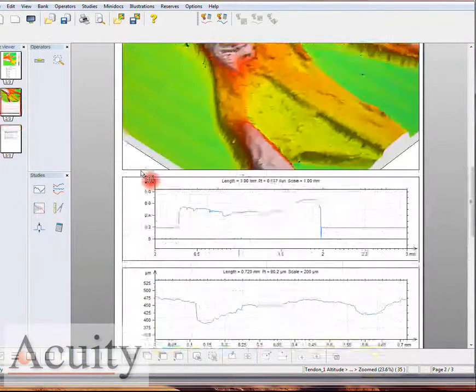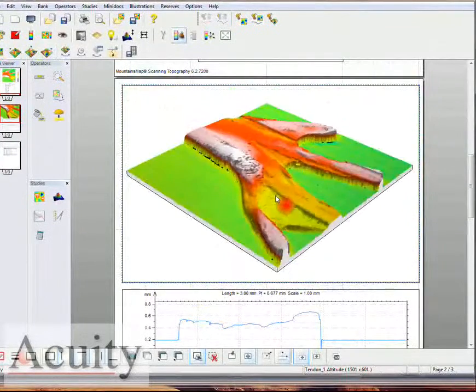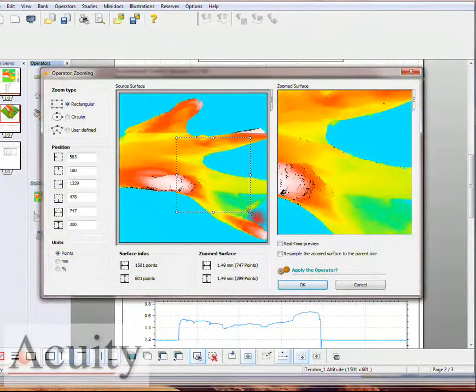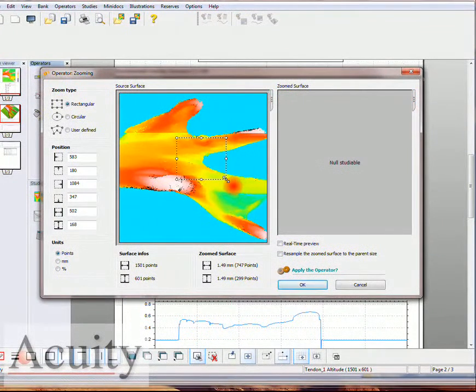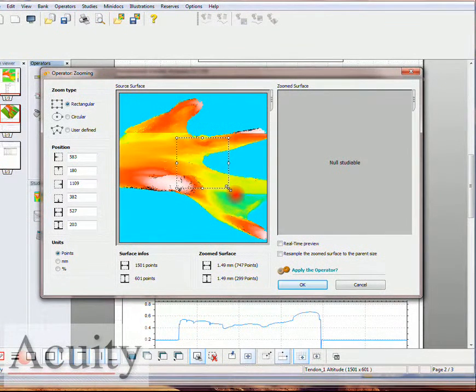Let's also take a look. We can zoom up on this feature too if we wanted to, so if there were a certain area where we wanted to look. Let's try and get this a little more square.